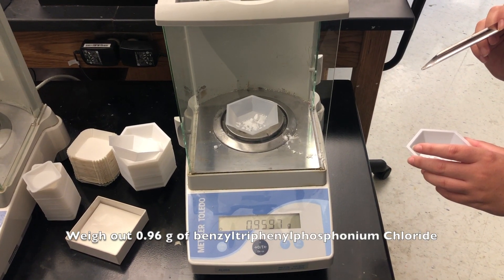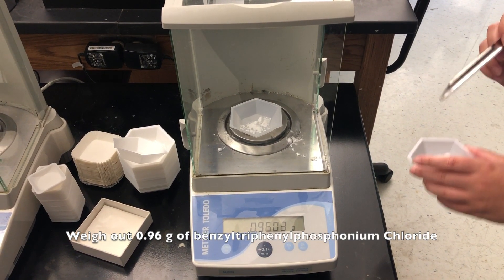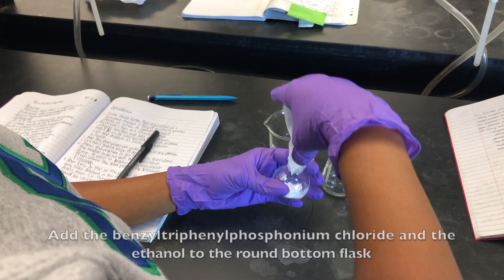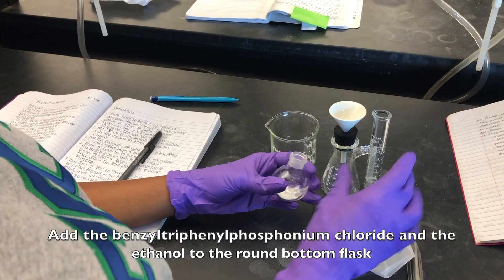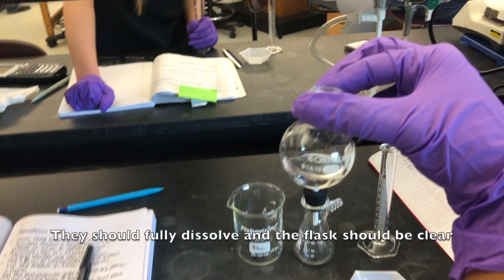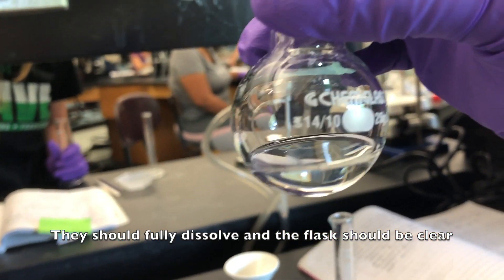Weigh 0.96 grams of benzyltriphenylphosphonium chloride. Add the benzyltriphenylphosphonium chloride and the ethanol to a round bottom flask. They should fully dissolve and the flask should be clear.